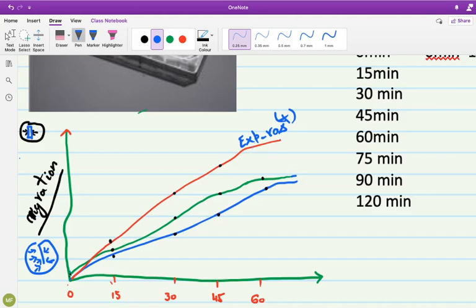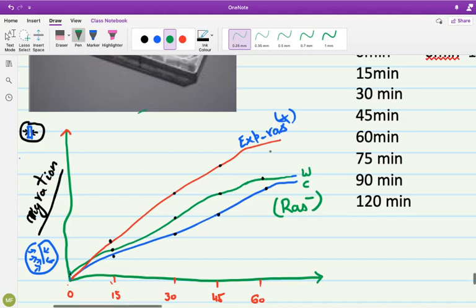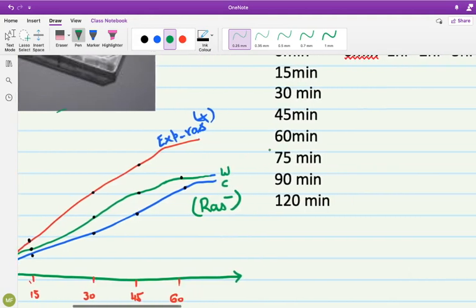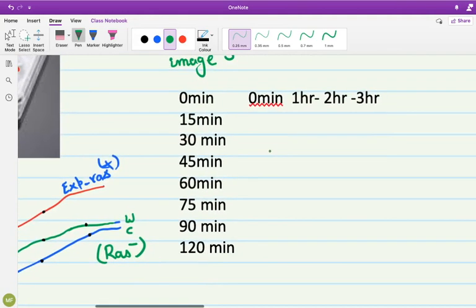This is how we say that RAS has an increased motility, increased expression of RAS, increased motility. But what we are observing in the remaining two cells, the wild type and control, both these cells do try to cover the bridge gap, but their induction is reduced. In the absence of RAS, when there is no RAS present, then the cells have a motility, but that is relatively low, when compared to RAS positive or over expression of RAS. This is how we infer the role of our gene of interest towards the cell motility.